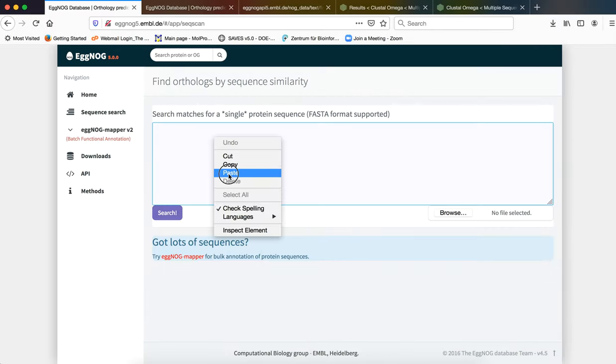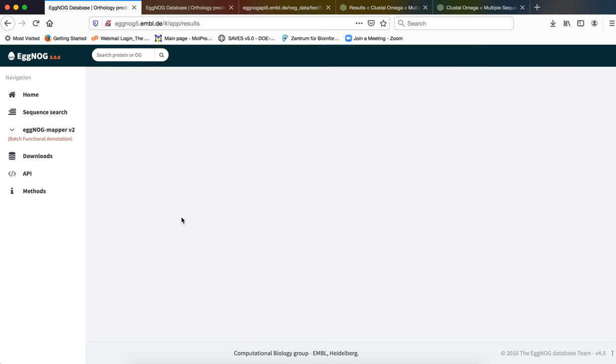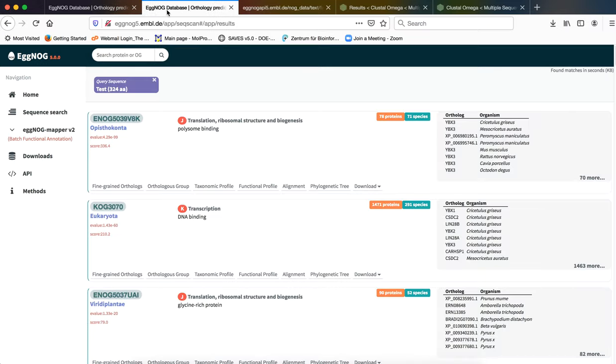Let us use the test sequence and we will then click on search. The result page that will be generated is this. As you can see, the first result that you get is the best set of orthologous group in context to the sequence that has been submitted.